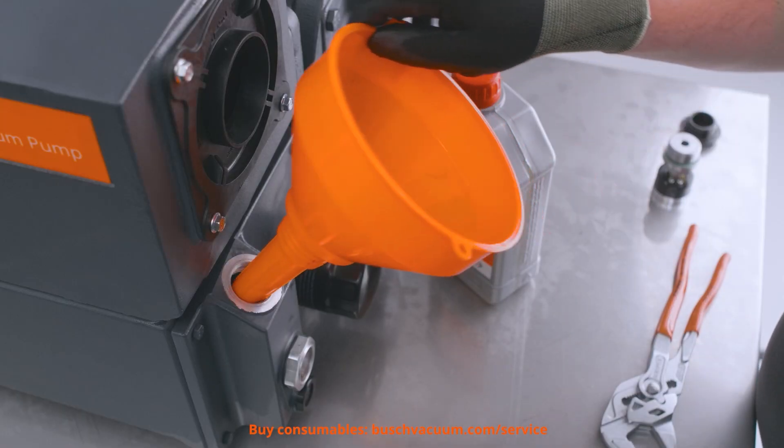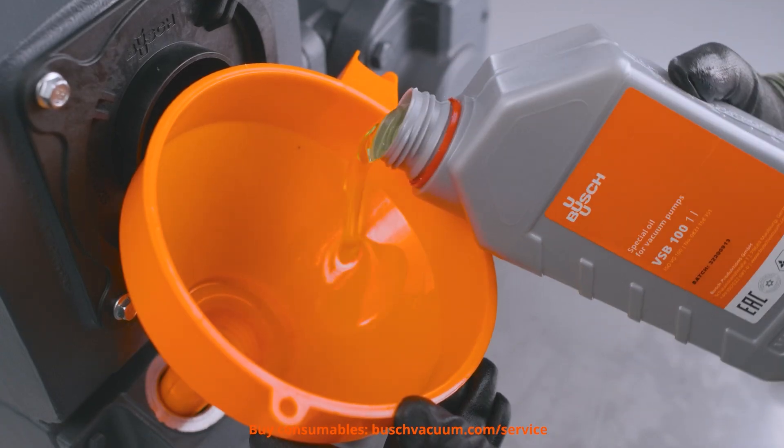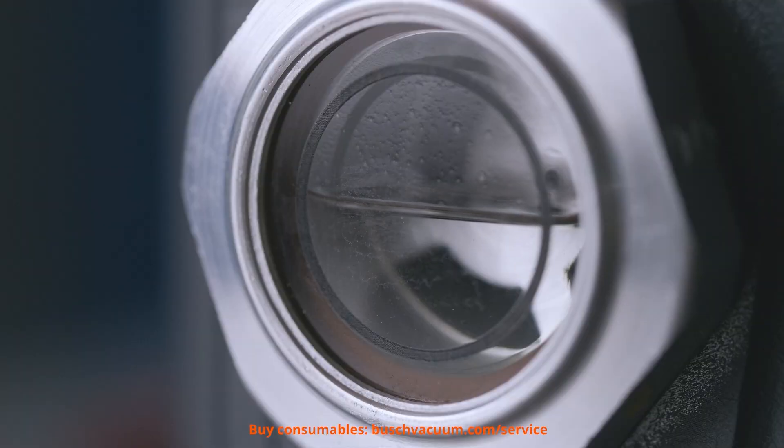Finally, we can fill in the new oil, up to the maximum level.